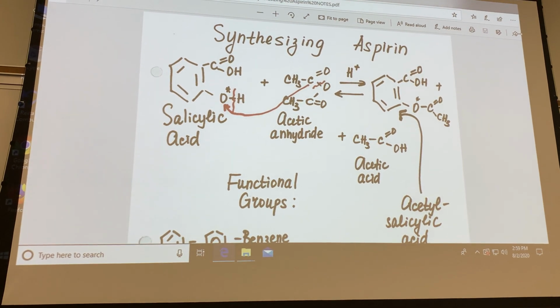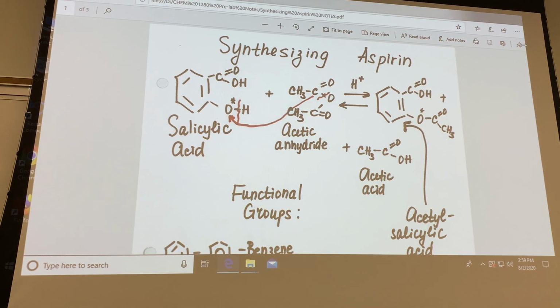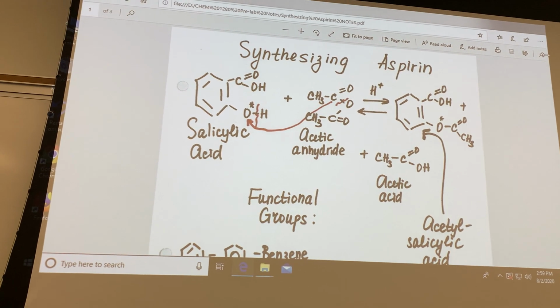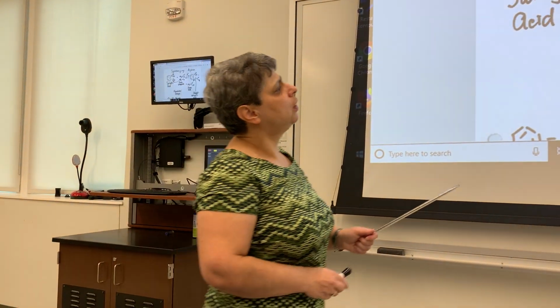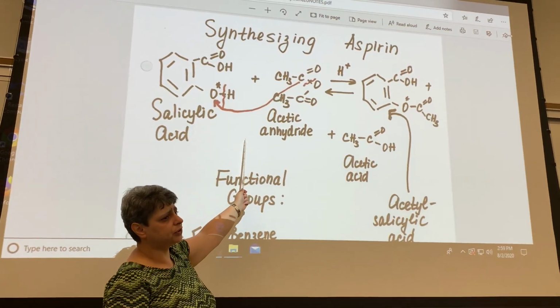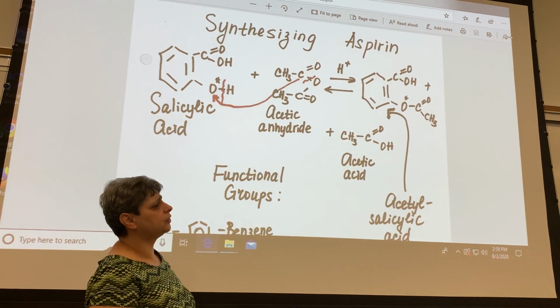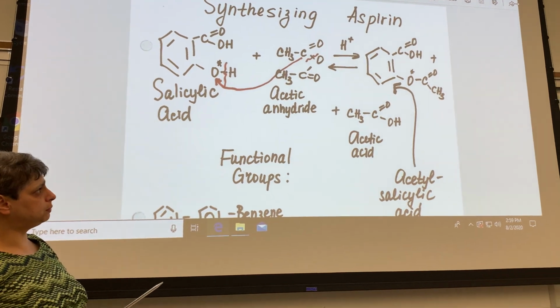And so the fact that this reaction is reversible, like the vast majority of organic reactions, I would say probably about 95% of all organic reactions tend to be reversible. The consequence of this is when you stop the reaction, even with more than about 15 to 20 minutes of heating, you basically have a situation where you know that your product is not going to be pure.